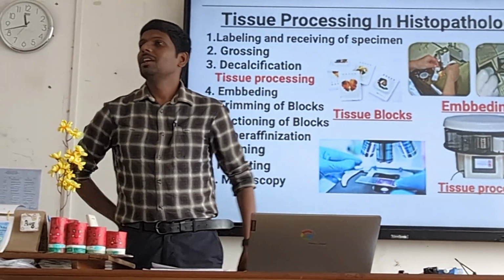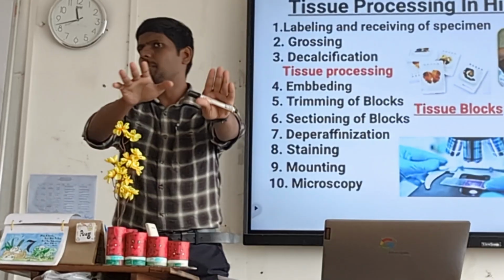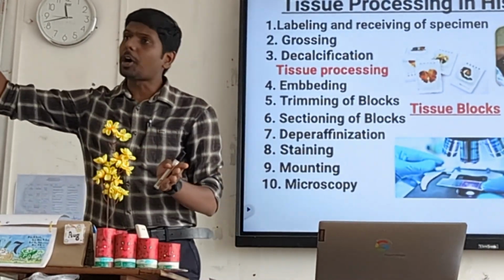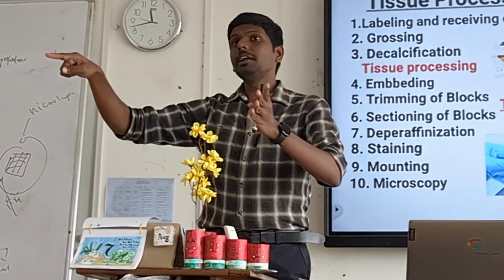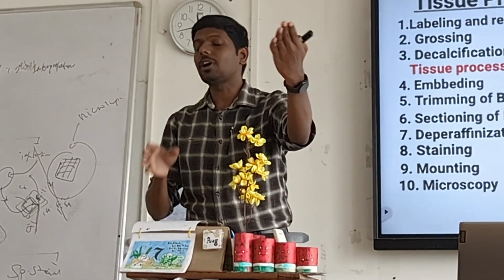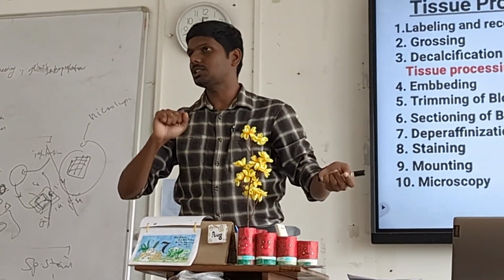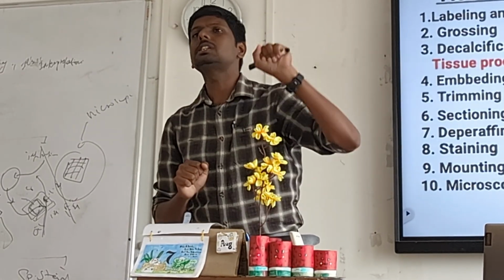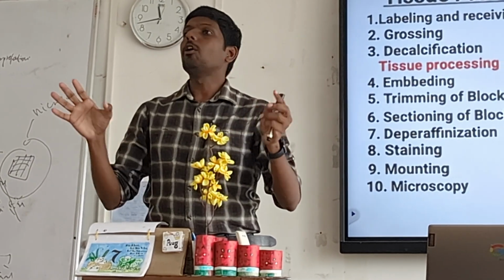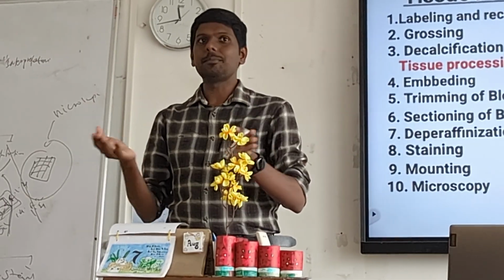Anyway, listen. When we stained it, if I want to preserve this slide, because this is my cancer patient actually. After giving my treatment, after 1 year, I will take one more biopsy. Now I need to cross check how the bone marrow condition was 1 year ago and what my bone marrow condition is after my treatment. Right? I need to preserve this stained smear. To preserve that, let me tell you a way, like lamination, right? Photo lamination or your degree certificate lamination.